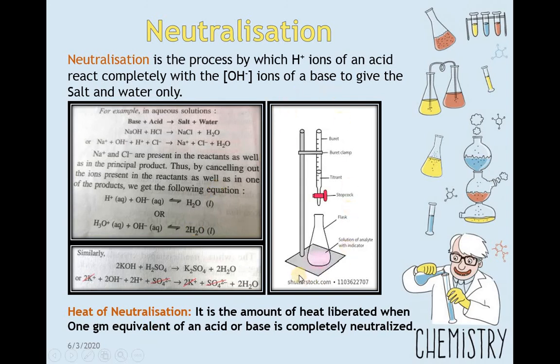Now let's discuss a little bit about titration. This is the neutralization you can do. Here in the conical flask you can take caustic soda. Here in the burette, as titrant, you can take the dilute sulfuric acid. So you will get sodium sulfate and water. This method is useful for the preparation of soluble salts of sodium, potassium and ammonia. Now to determine whether the neutralization process is completed or not, this process, which is called titration, is done.